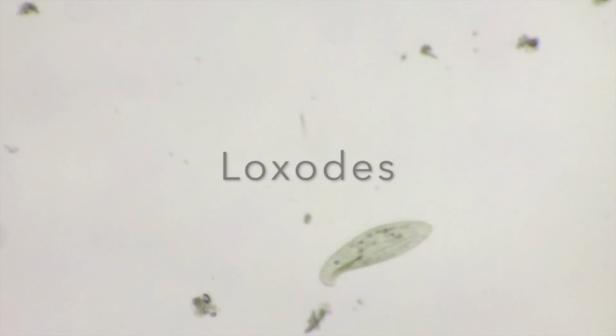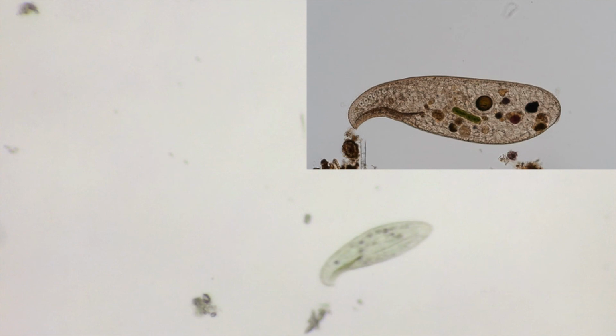They are long, flattened ciliates of the Karyorelictea class that live in freshwater sediment and, interestingly enough, are capable of respiration using nitrates. Most are omnivorous and contain symbiotic zoochlorellae.